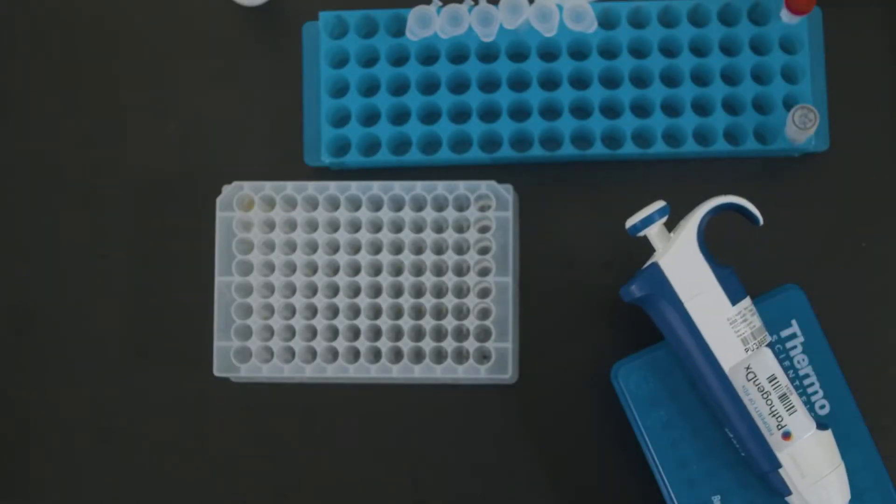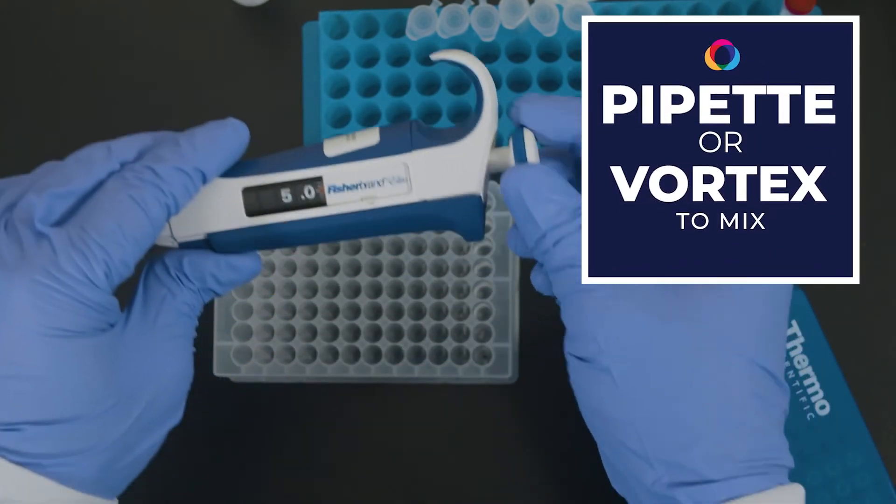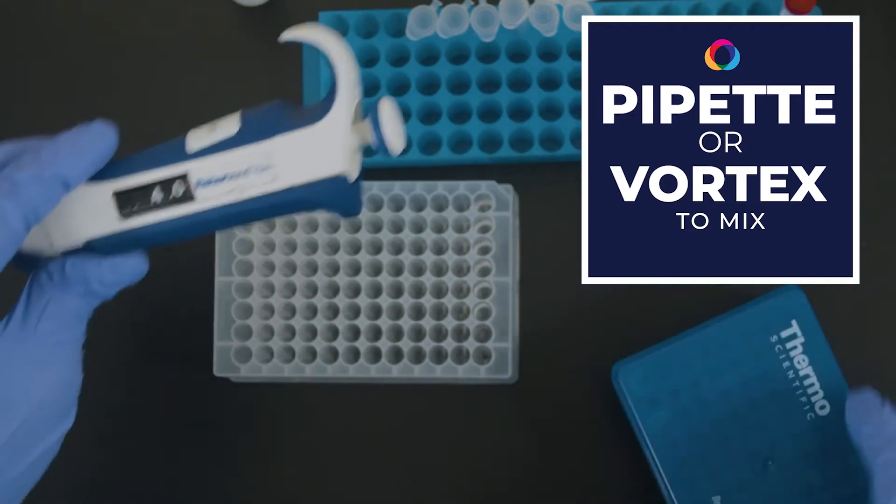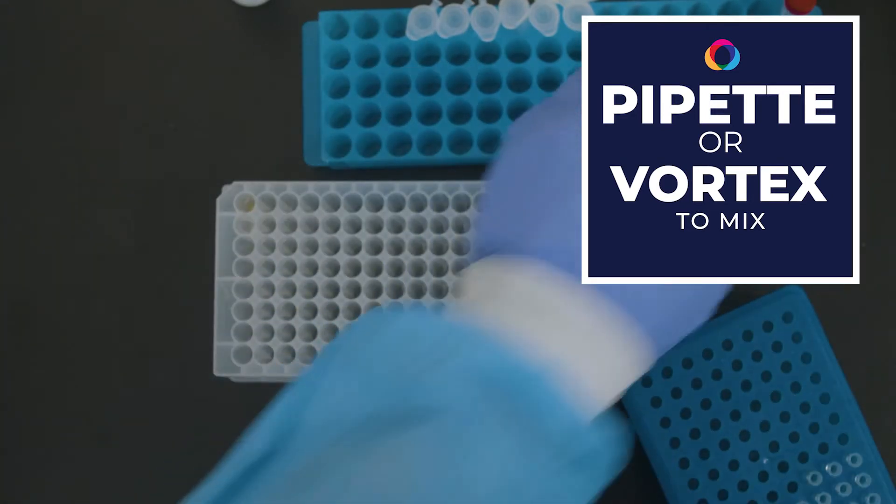Add 4 microliters of Proteinase K to the 400 microliter sample. Pipette up and down to mix in plates, or vortex to mix in tubes. This step is optional but recommended for complex sample types.